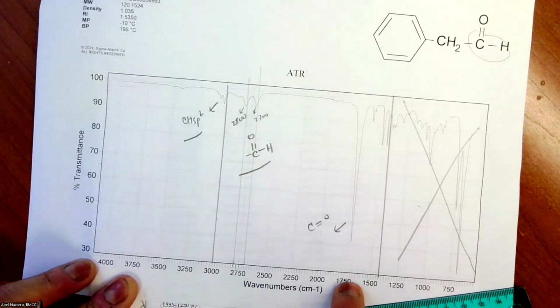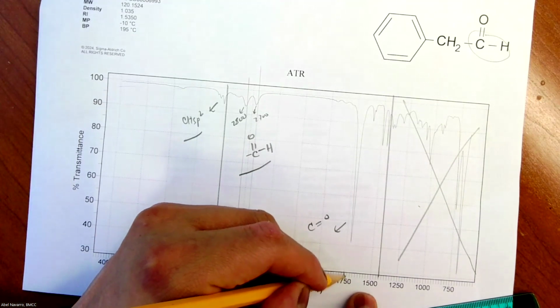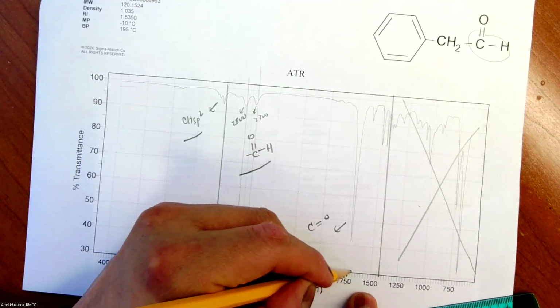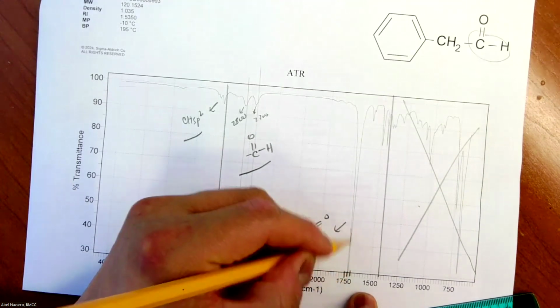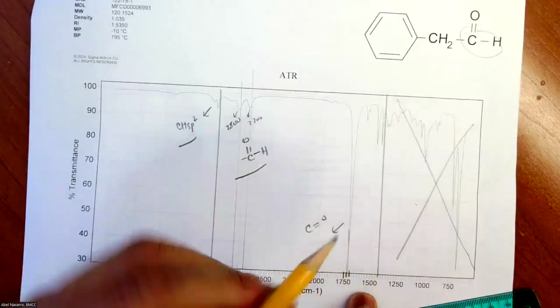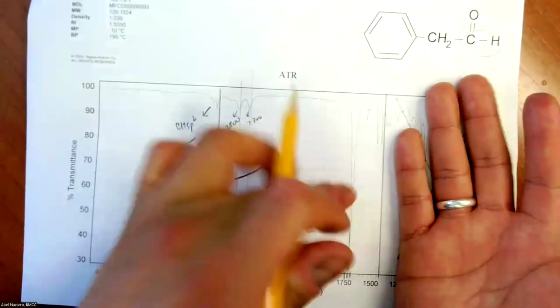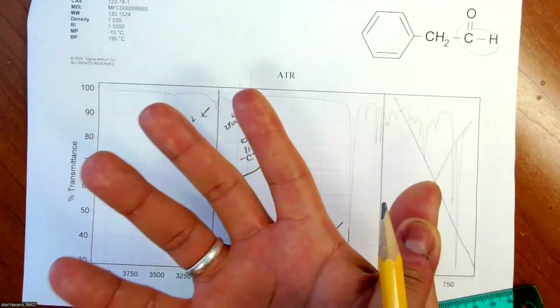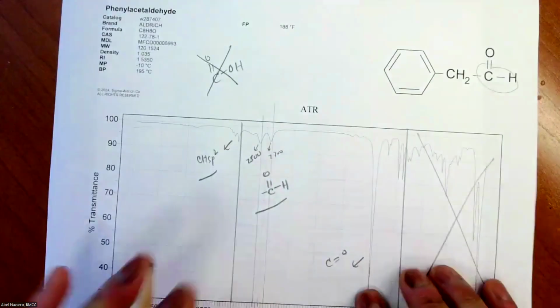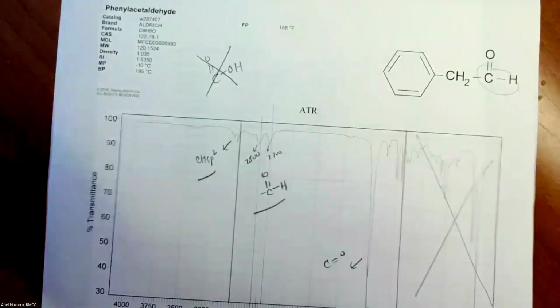Why? Because it's at a little bit less than 1725. Remember, each of these lines is 25. So this is 1750, 1725, so the peak is more in the 17 range, a little bit lower than 1725. This tells me only that you have a C=O. I don't know if it is a ketone, aldehyde, amide, carboxylic acid, or ester. Definitely it's not a carboxylic acid, because then I would see a distortion here.